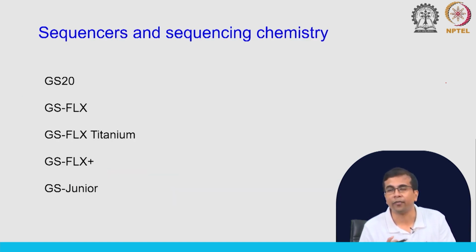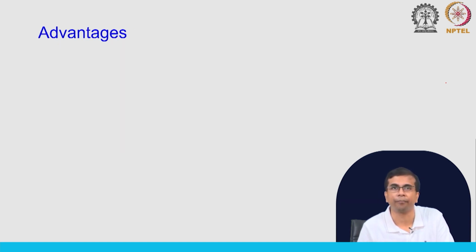that were available when 454 sequencing was done. So, these are again slightly different chemistries, slightly different processes, right, and slightly improved ones. Also the differences in throughput, right, how many sequences you can get in one experiment. There was this difference because sometimes you have a smaller number of samples, in some cases you have a very high number of samples. So, depending on your need you would use these platforms. Okay. So, these are the names of them and you could use them if you wanted to do 454 sequencing.